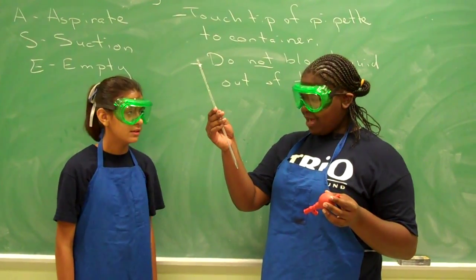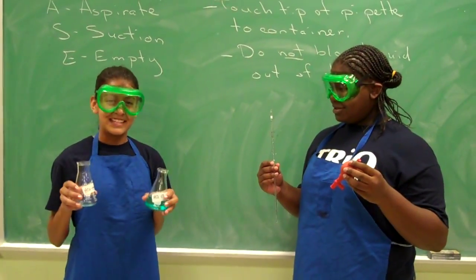This is a pipette, and this is a pipette bulb. And these are Erlenmeyer flasks.